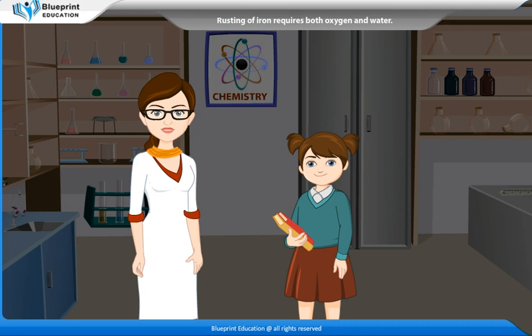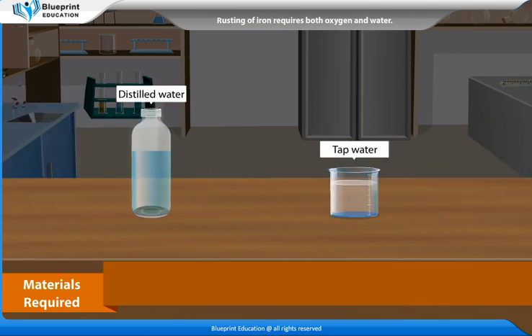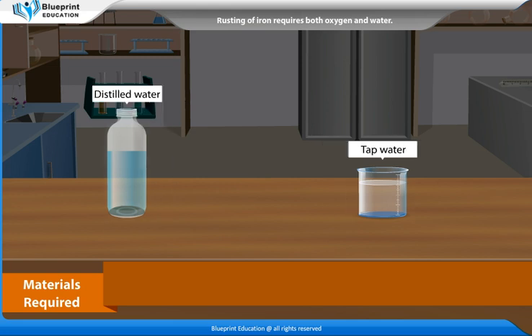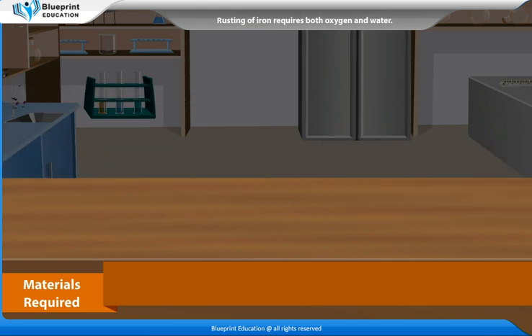Let's perform an experiment to show that rusting of iron requires both oxygen and water. The materials required are 3 test tubes, iron nails, distilled water, tap water, anhydrous calcium chloride, 3 corks, and oil.